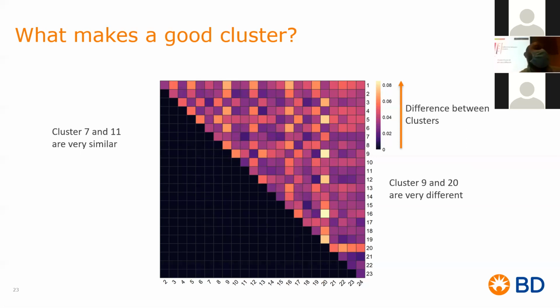And the more omics, the better, right? With BD, we could only handle 2 at the time, right now, but multiomics goes beyond that. It goes into metabolomics, probably pronouncing it wrong. And there are a lot more omics. As technology progresses, we'll be able to incorporate more and more data into it.